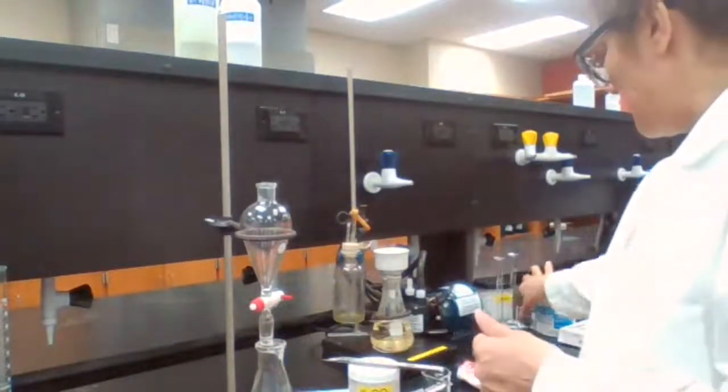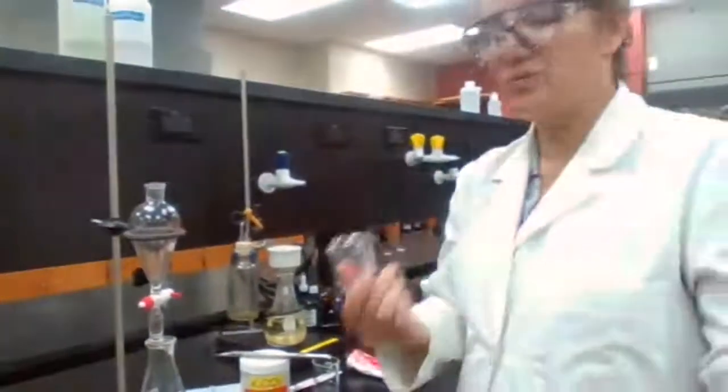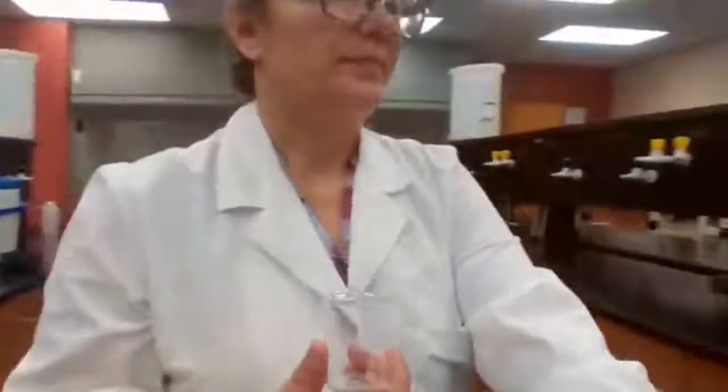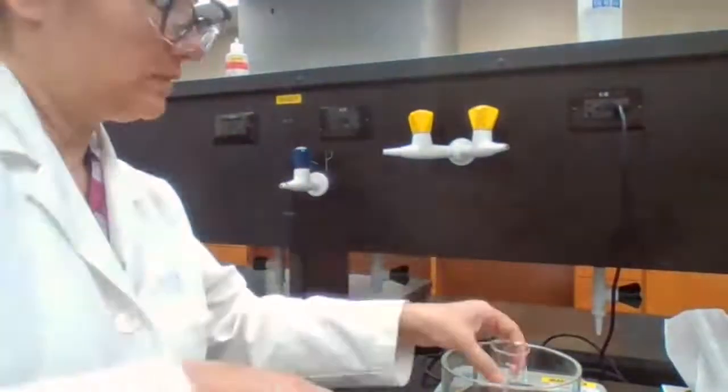Then I'm going to transfer into a pre-weighed beaker because we need the mass of the substance for our calculation.